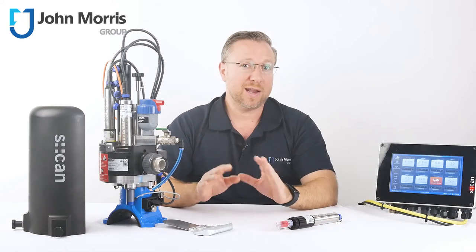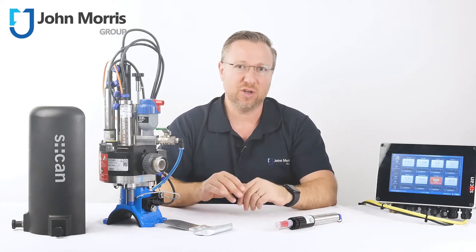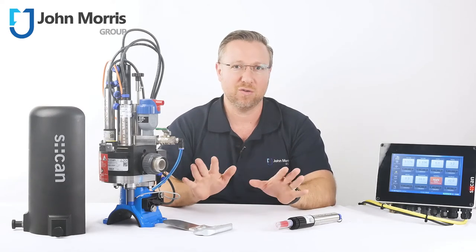Four, you can have the data however you want it — LAN, Wi-Fi, analog, Modbus, et cetera. You can have the data via S-CAN's network or remaining on yours without going via a third party.